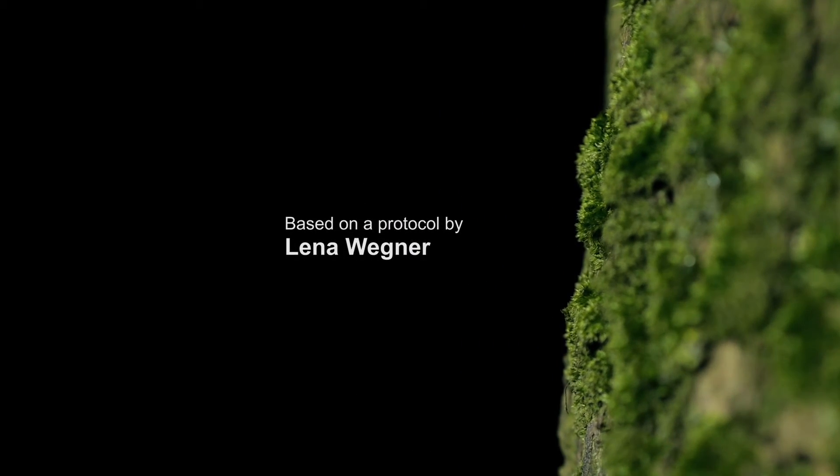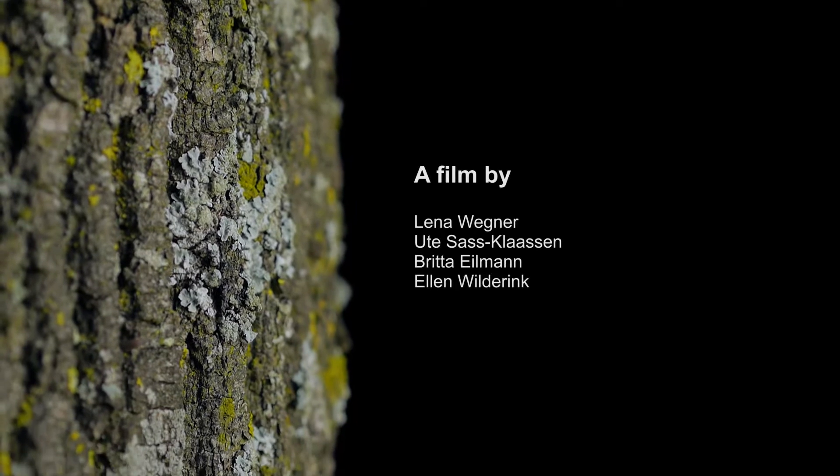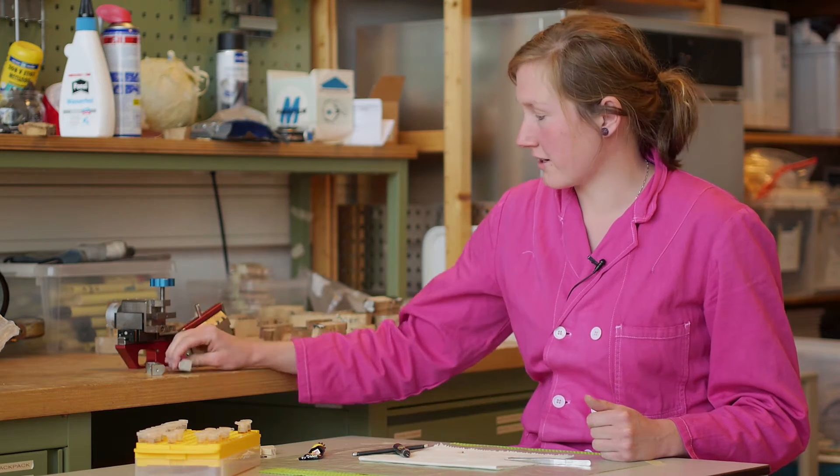Thank you very much for joining us! If you take microcores with a Trephor, you will get very small samples with a diameter of 2 mm or even less. You cannot clamp these into a microtome because the samples are just too small, and even additional clamps don't help.